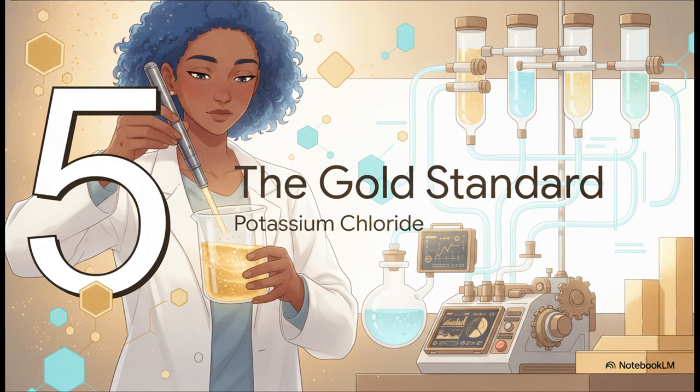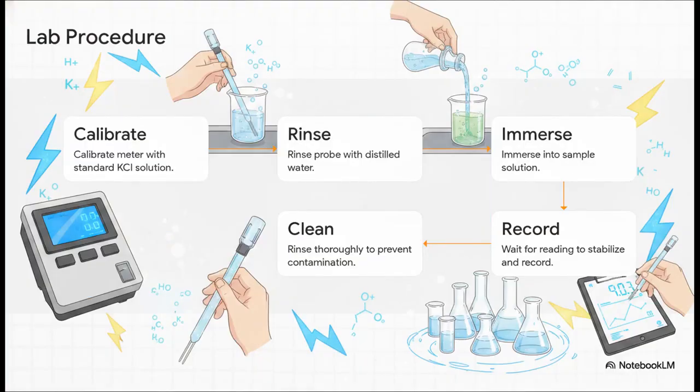To make sure any of these measurements are actually accurate across different environments, we have to calibrate our instruments. You can't just dunk a probe into a beaker and trust whatever number pops up. There's a very specific, step-by-step laboratory procedure you need to follow.